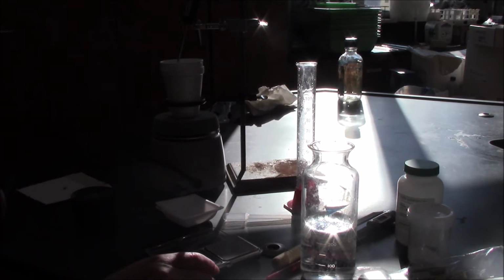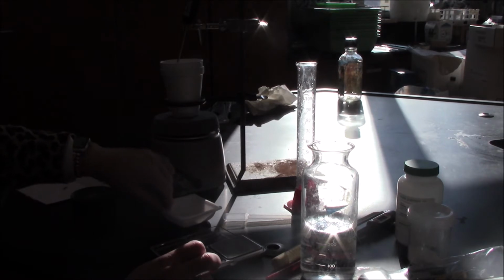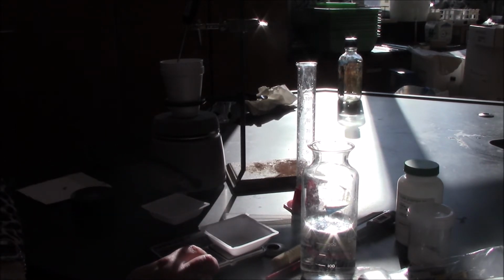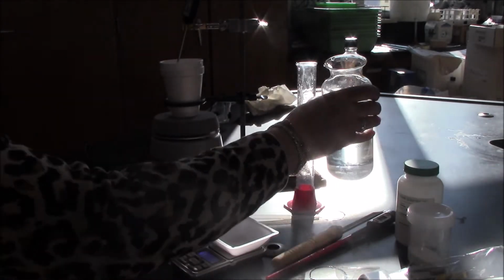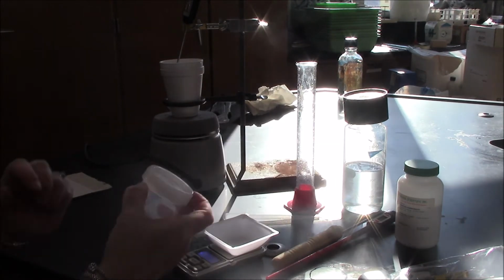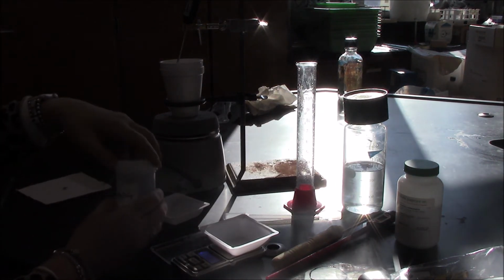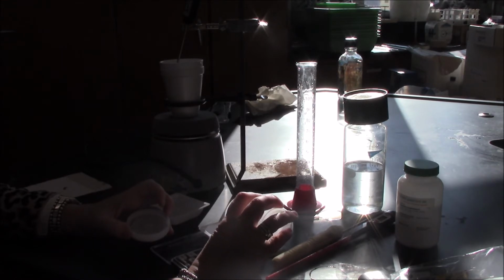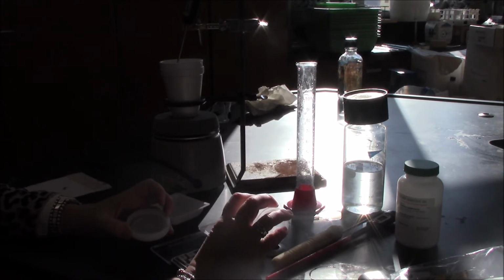Okay. In the meantime, I'm going to turn on my jewelry scale. I'm going to take a weighing boat, press tare, and I'm going to measure out 5 grams of the substance magnesium sulfate. Doesn't have to be perfect. However, I do have to record the mass that I add.